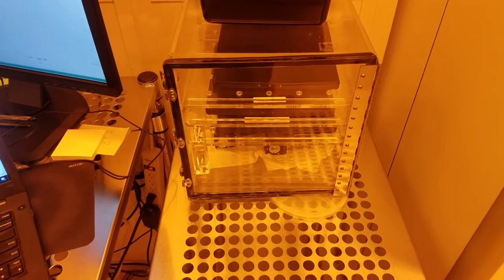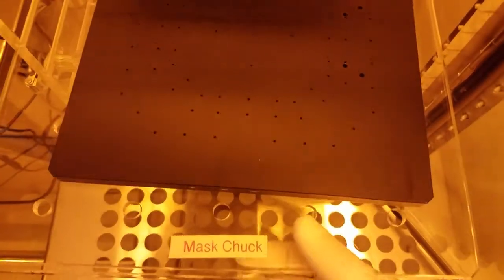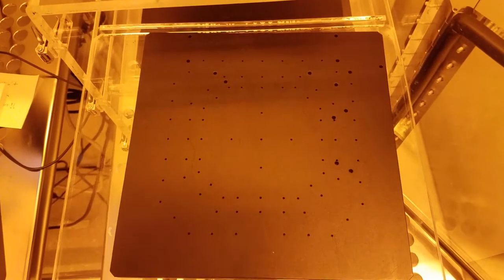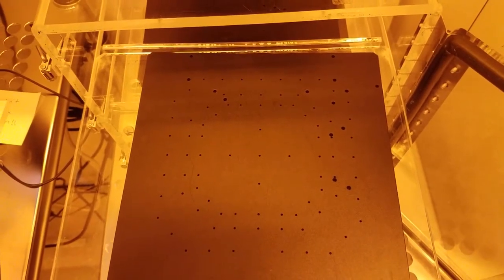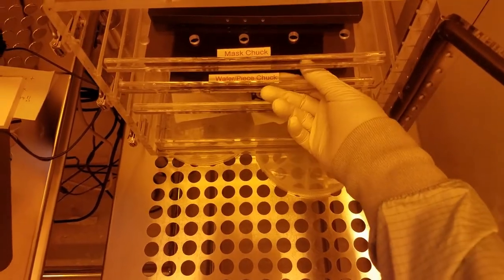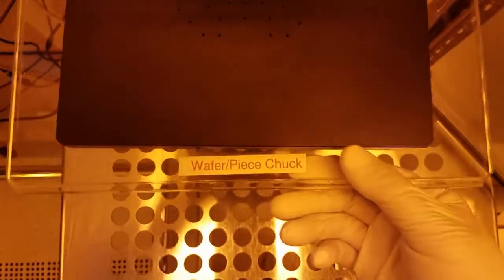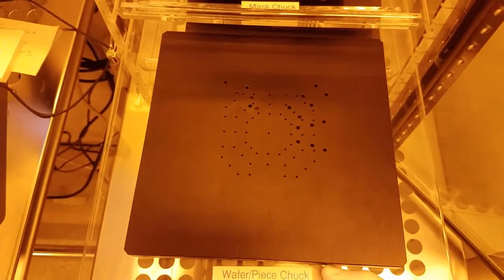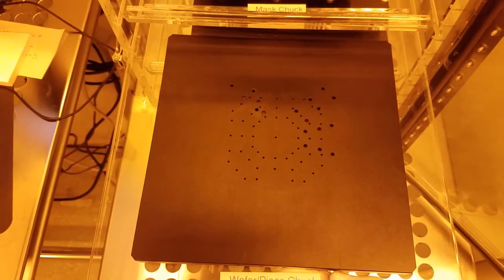Next we need to load the correct chuck for our sample. This chuck is the mask chuck. You should be able to use it for any sample that's larger than 4 inches in diameter. 5 inch and 7 inch photo masks should be used as well as 6 inch wafers. The chuck here is the wafer and piece chuck. You should use this chuck for any sample that's 4 inches in diameter or smaller.